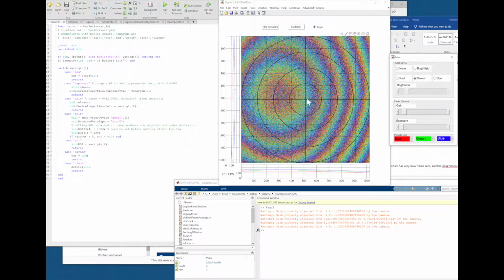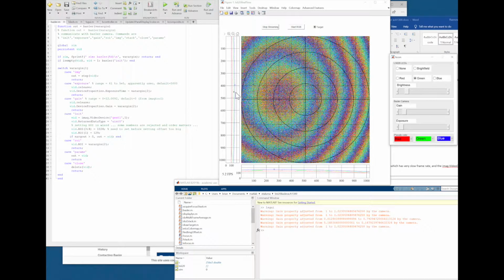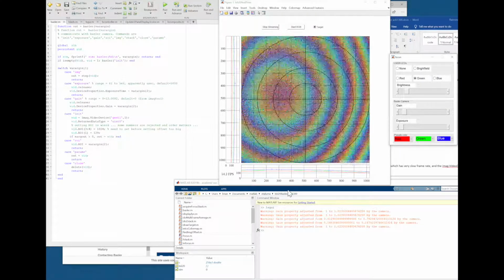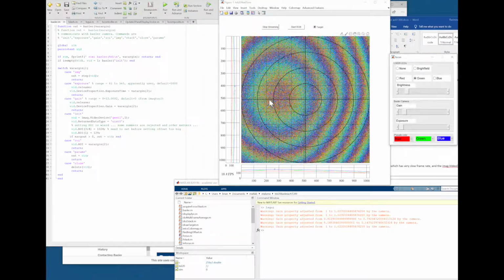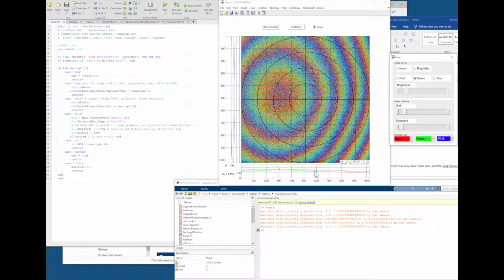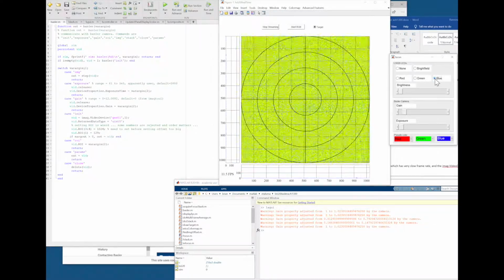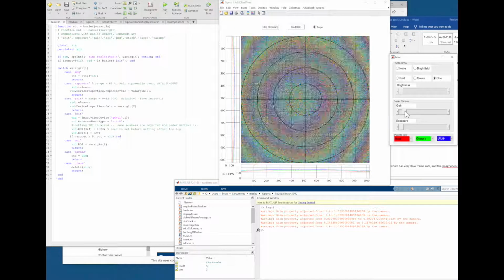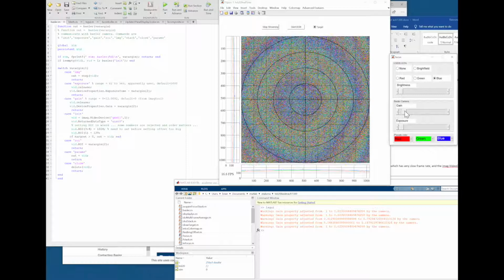The other thing too that helps with alignment, these little dots represent the max and min, or the maxima of the peak and the mean, and so they're dancing around to coincide with the location. So for adjustment, it'd be pretty easy to just try and get those dots over. Let's see how blue does. I think blue is super bright. We've already saturated, I think, with blue. There we go. So blue is pretty well aligned.